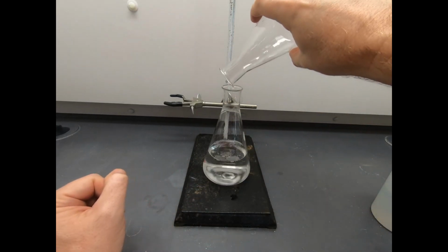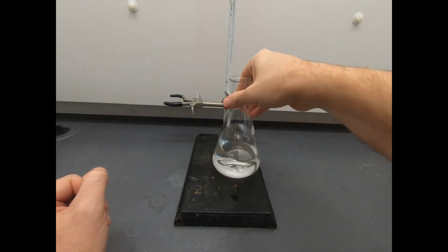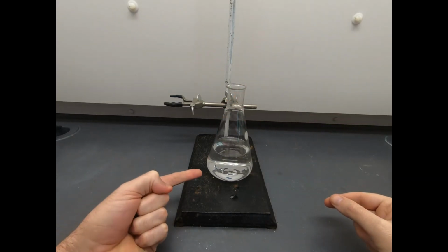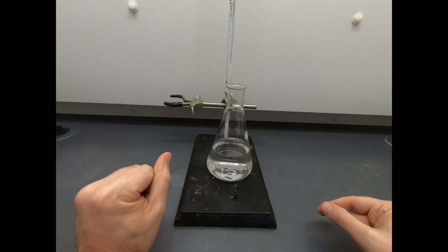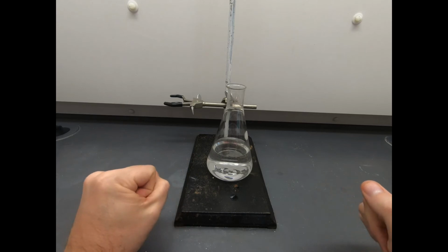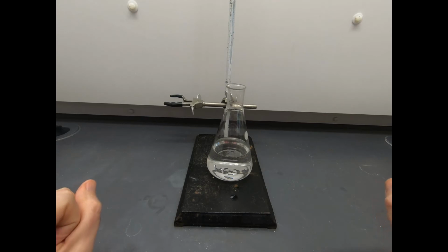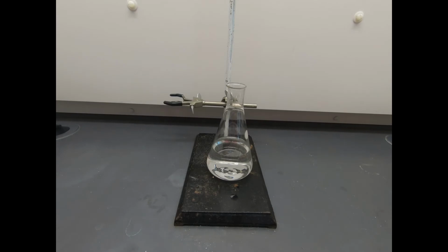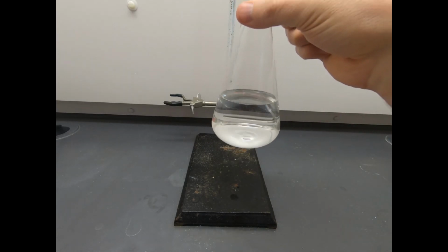Okay. Fantastic. So this is now mostly a water solution. It contains some acid. It contains our material. It also contains some isopropanol, and that isopropanol doesn't help us one bit, but it's what we had to use for this extraction. So to help this along and to help get some precipitate, what we're going to do, and there may be just a hint of solid forming. Let me talk first. I'm not sure if you can see anything. It's hard to tell if those are gas bubbles. Those might be just slight air bubbles.